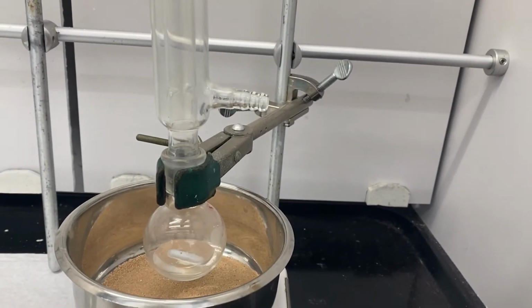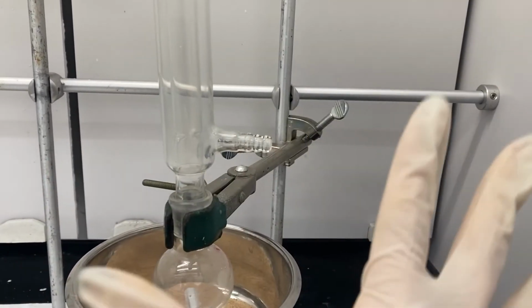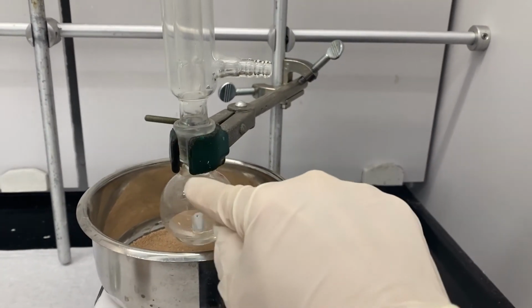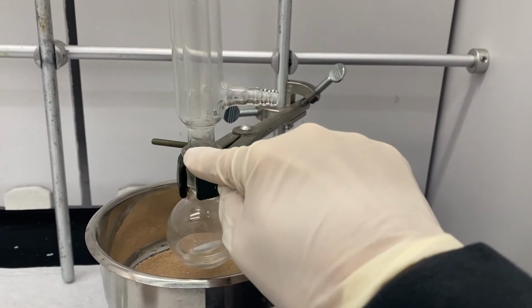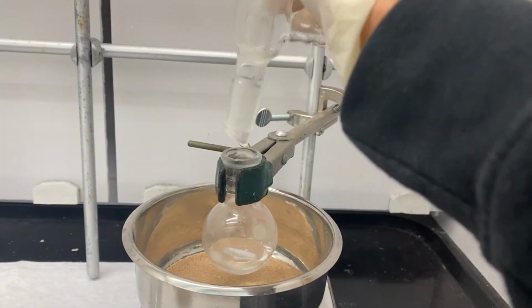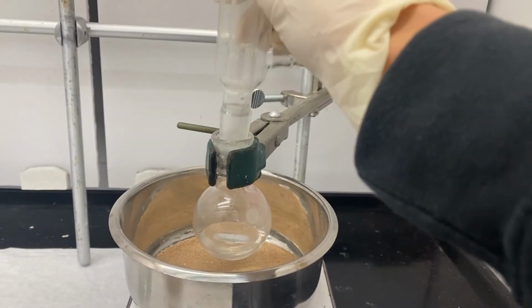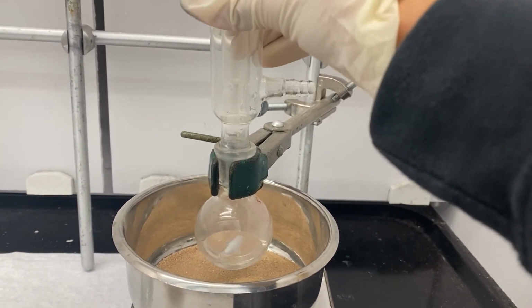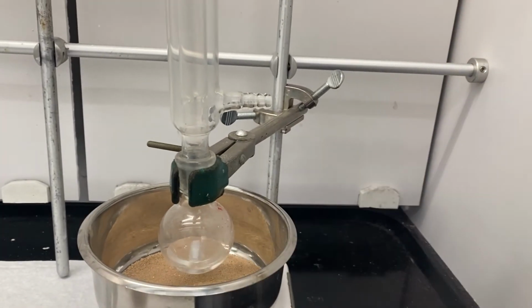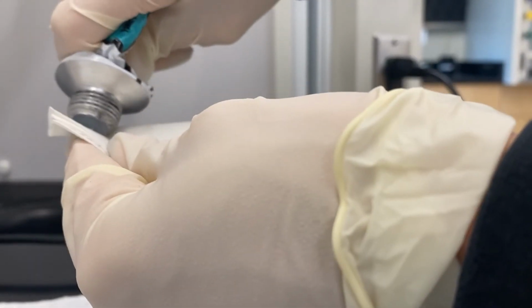the round bottom. Anytime we use a reflux condenser, it's important that we just stack the deck and make sure we don't lose any vapors. And if the vapors pass through this joint, well, it's possible that they could seep out before they hit the cold condenser. Grease lightly the top of this ground glass joint, and we'll put it in our joint and just twist it so that we get a nice tight seal. Just adding some grease to a little paper towel.